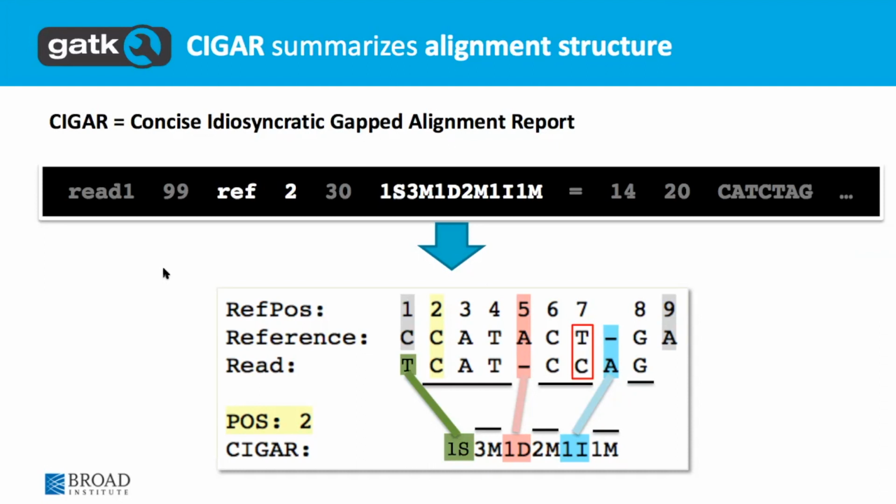Yes? Sorry, can you say that again? Oh, that's just for the next. So this read has these positions. That's just the next base after the read.